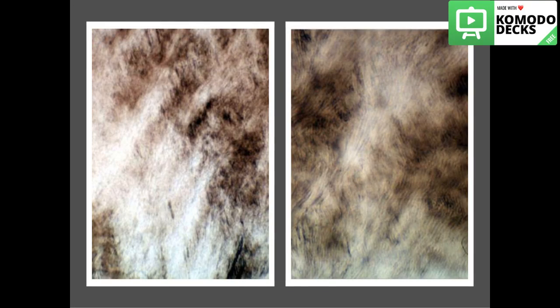As we also see here, they make this twisting phenomenon above cusps mostly. Gnarled enamel.